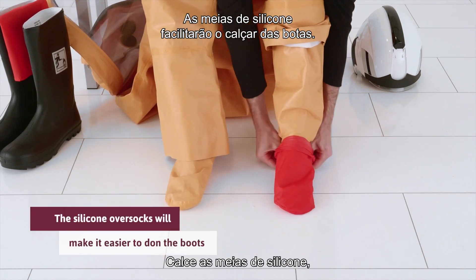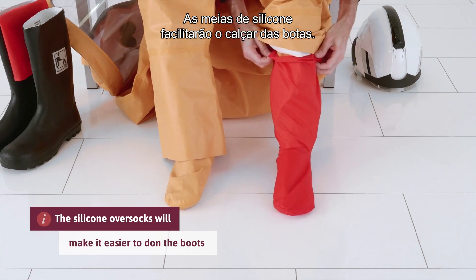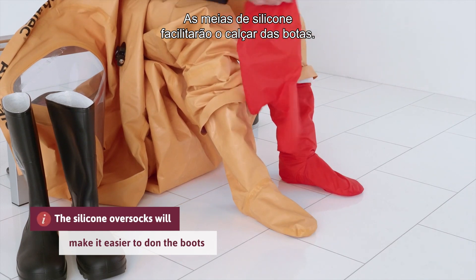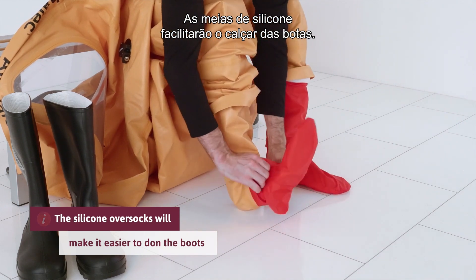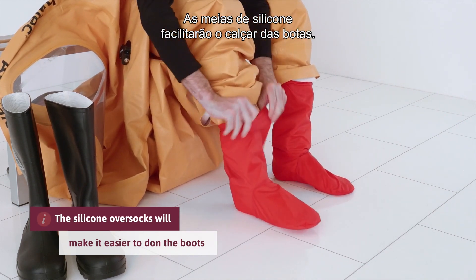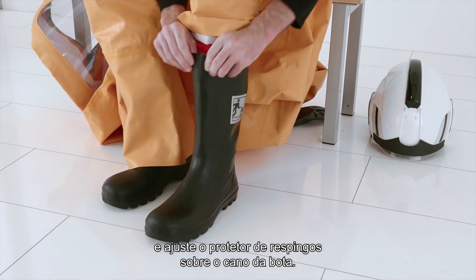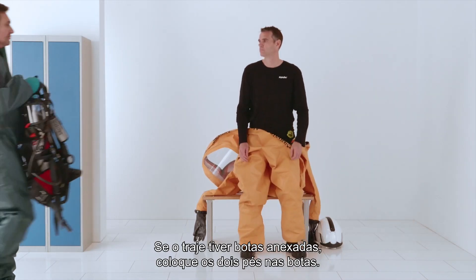Put on the silicone oversocks. Then put on the safety boots and adjust the splash guard over the boot shaft. If the suit has attached boots, put both feet into the boots.